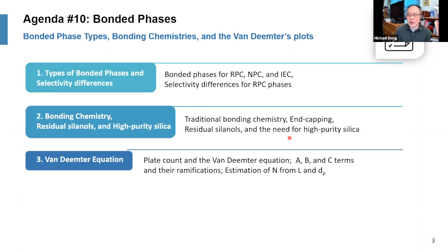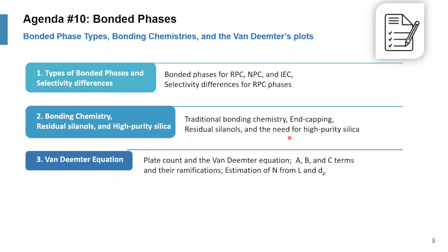Recalling high school chemistry 101, we talk about different bonding chemistry, and we say the ionic bonds are very strong. We talk about dispersive forces, such as the forces between the rare gases. Okay, so sometimes when you talk about argons, they kind of come together by dispersive forces, right? So these are very weak forces.